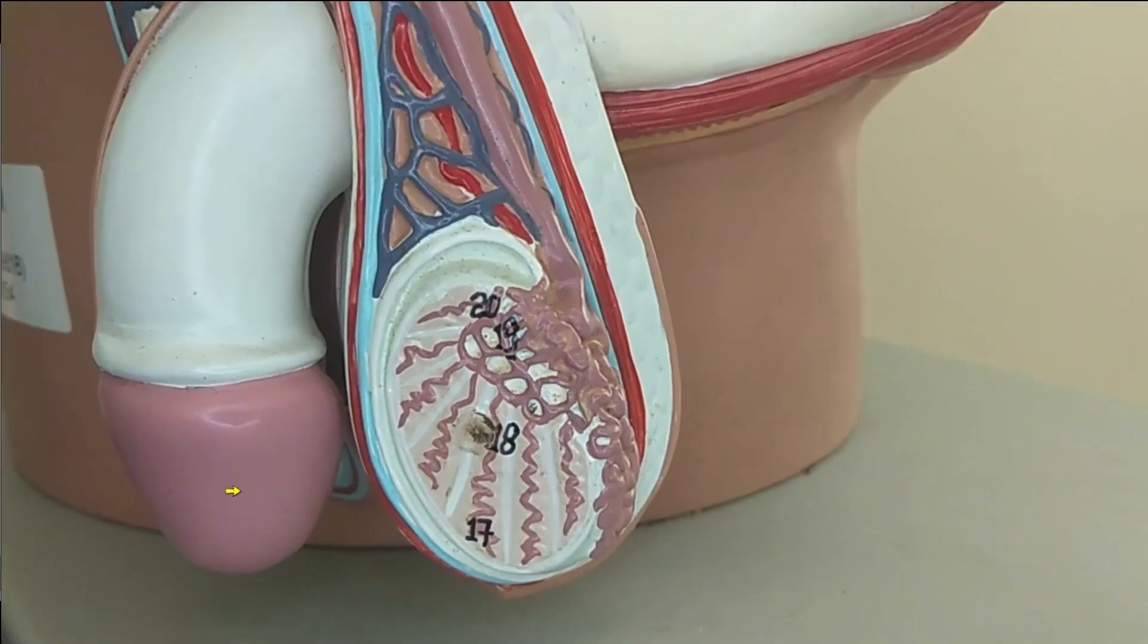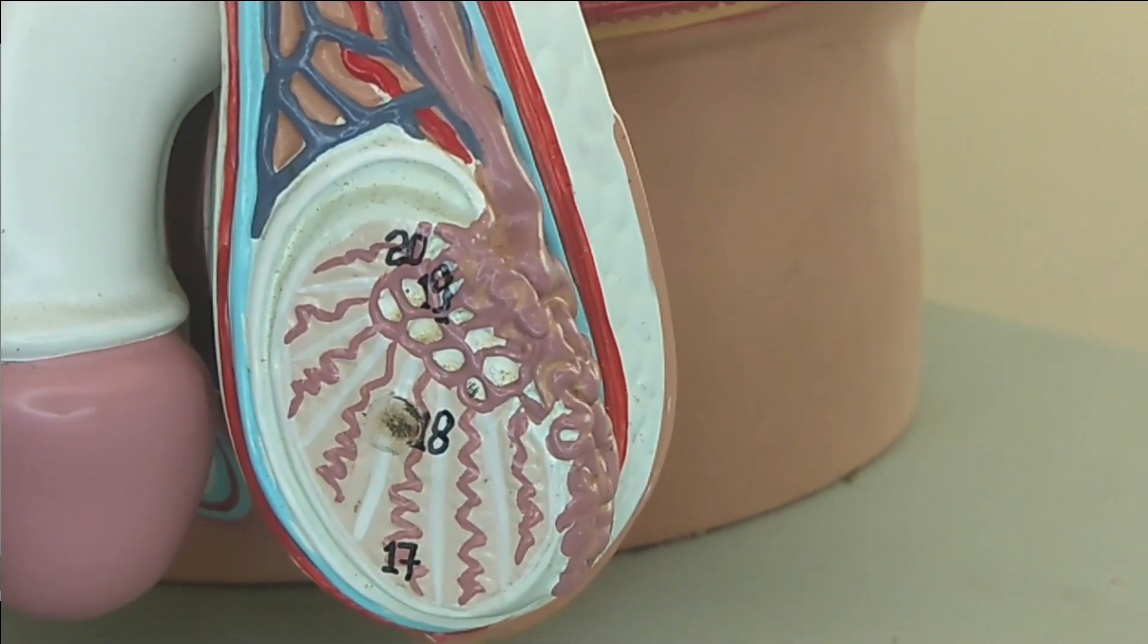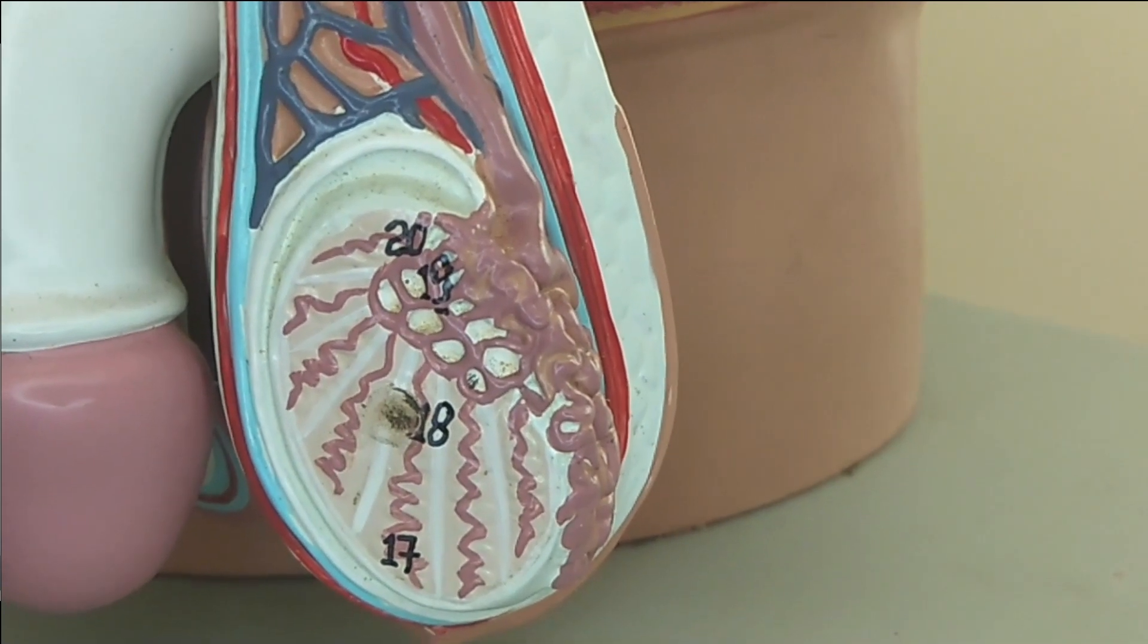The testis is surrounded by the scrotum. In the testis, there are seminiferous tubules coiling up.